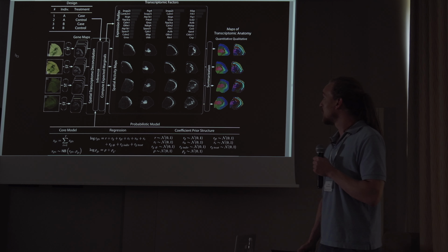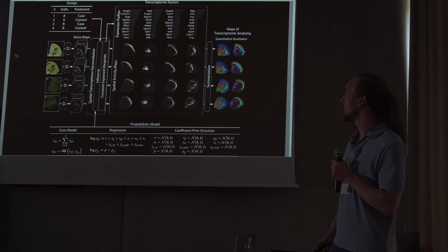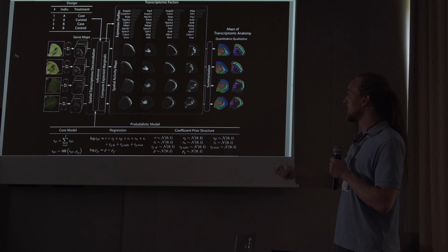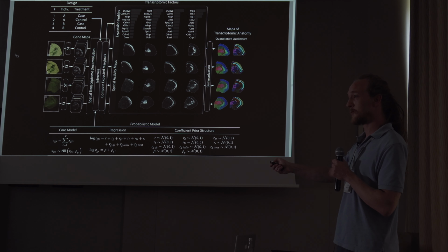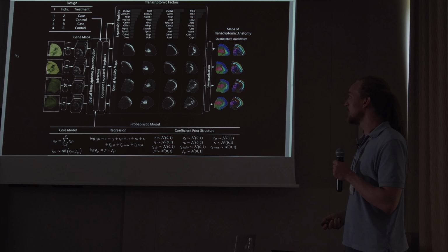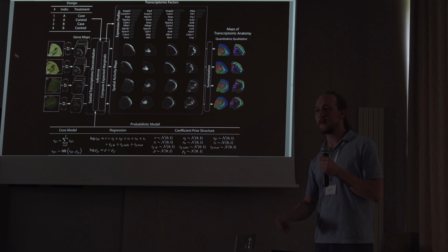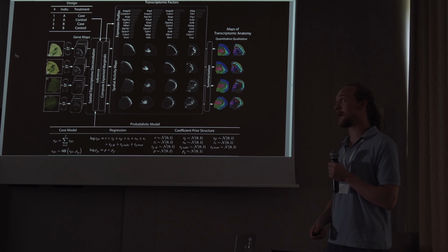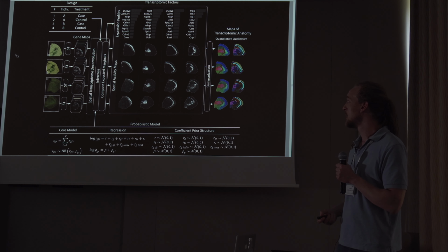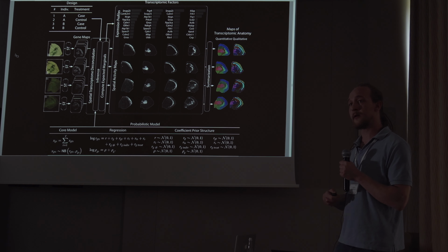This is figure 1 from our paper and supposed to give an overview of the general setup. It indicates that on the left we have 4 samples, for each of which we do spatial transcriptomics separately, so that we end up with a set of gene maps, 1 for each gene and for each sample. Now these gene maps are quite numerous. There might be 20,000 and you might have 10 samples, so you got to look at 200,000 pictures. It's a little bit much, and I hope that this approach would allow you to compress this information in an interpretable manner.